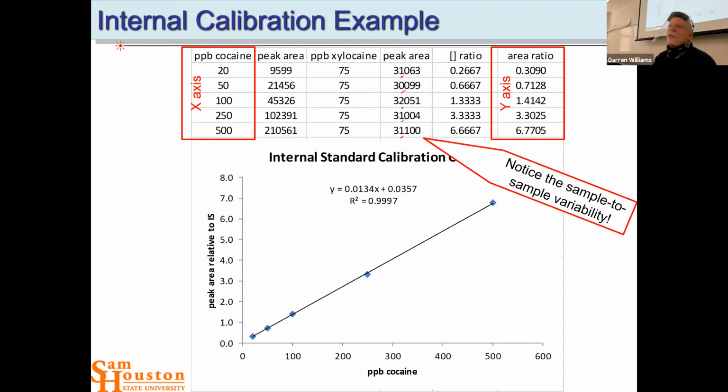And once we got rid of the analyst's technique and jabbing the needle through the inlet and squirting the sample into the inlet, if they did it slower, more evaporated, the peaks were spread out and so on. They did it really fast, they might get more of a concentrated signal. So this peak area goes all the way back to how you inject the sample. And we went to auto injectors and really improved the situation quite a bit.